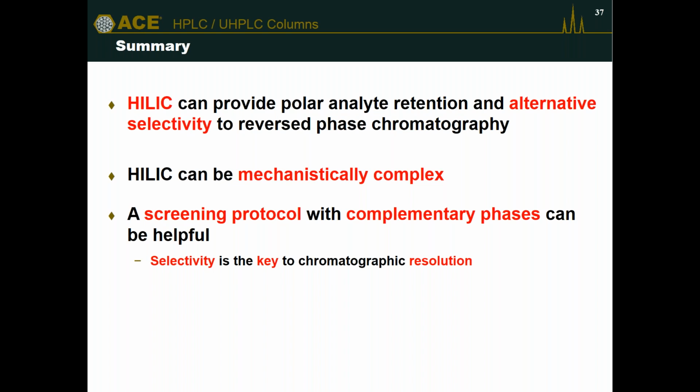I've explained and described a screening protocol, which we have available in a book and on a wall chart, a poster, sorry, for you to look at. This is a systematic approach to method development in HILIC. We also have something similar for reverse phase coming out soon.